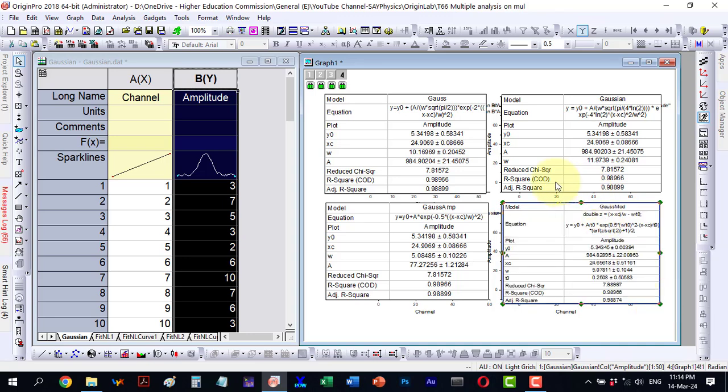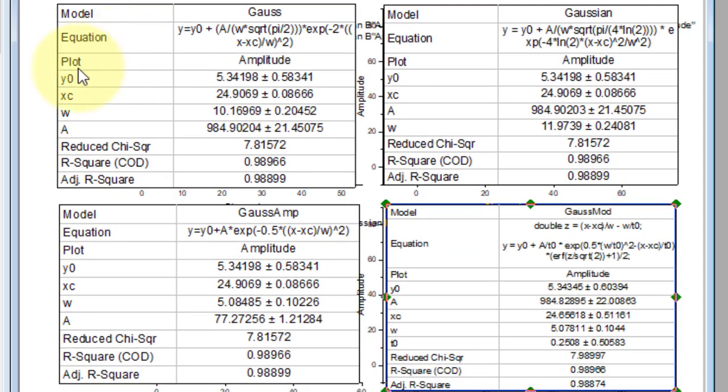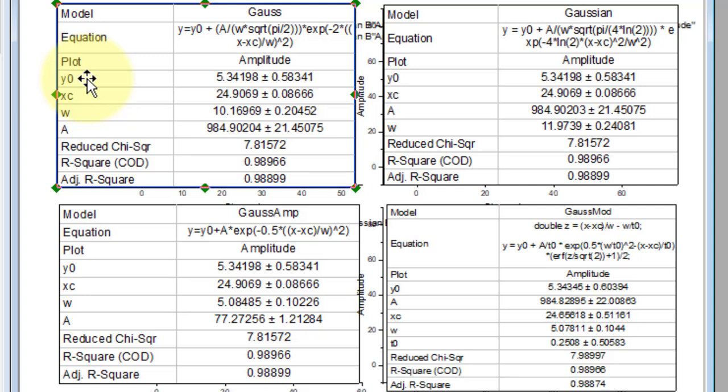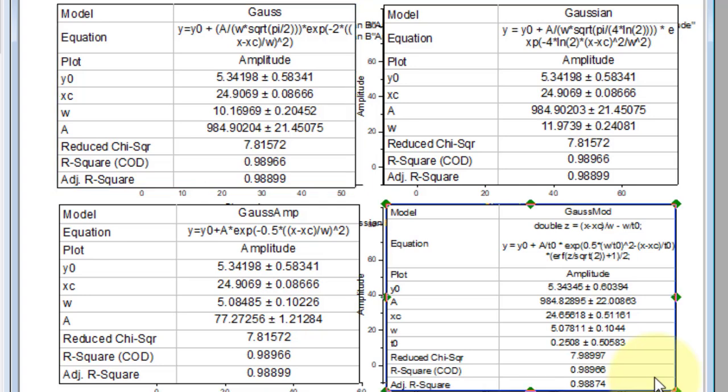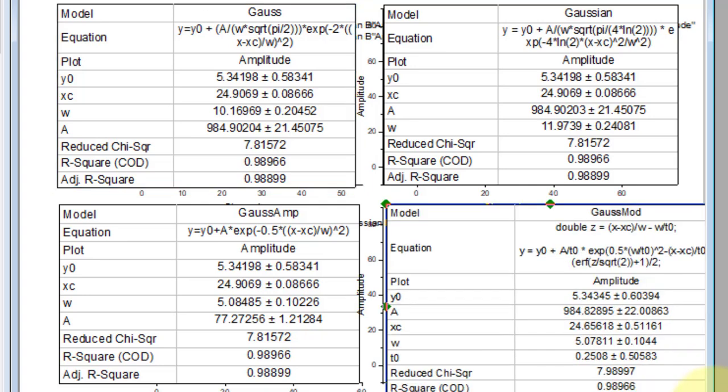Now observe, we have different functions here: gauss, gaussian, GaussAmp and GaussMod functions. We have y0 here, which essentially represents the y-axis offset. It is 5.34198, 5.34198. Here the value is the same and here it is almost identical. Let me maximize this one a bit more to enhance visibility. Here this one is slightly different from the others.